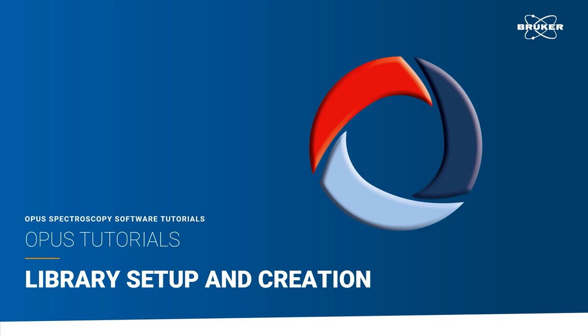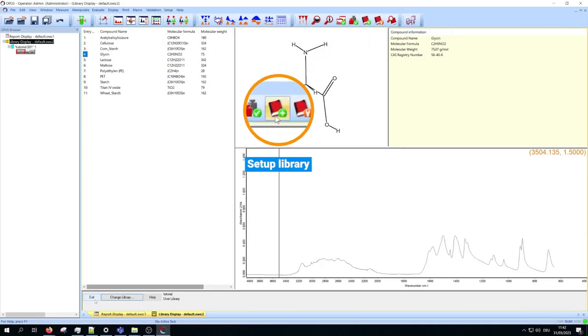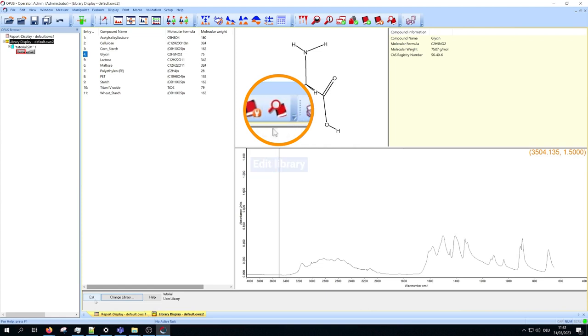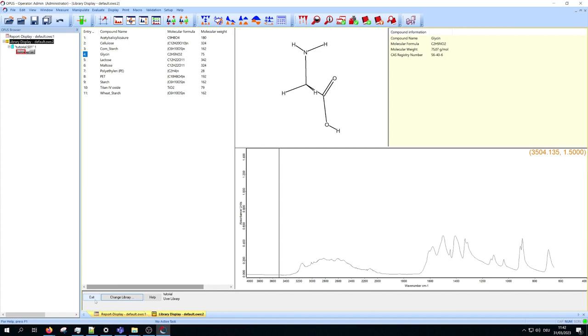Hello and welcome to this library setup tutorial. To create or manipulate your own library, we use the functions setup library, edit library, and browse library. In the first part of the video we deal with how to create your own library. In the second part, how to edit your library later.